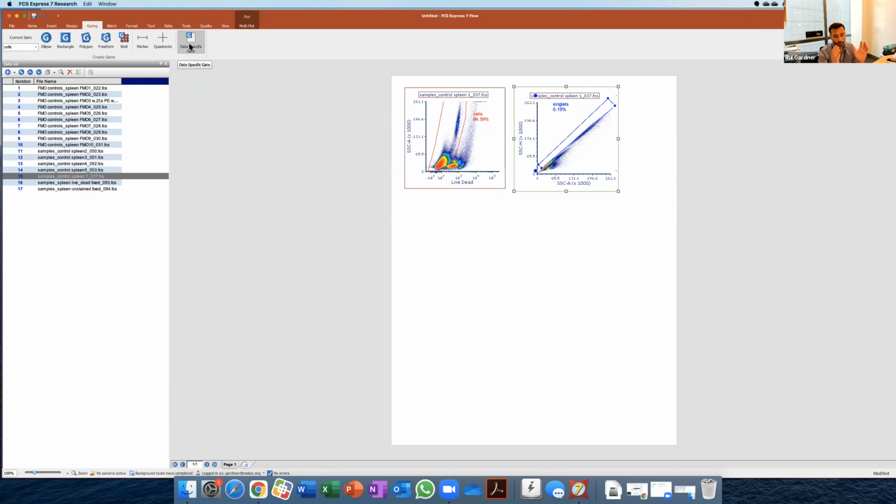And then when we start gating the actual populations, we're going to use our controls to be able to set the gates appropriately. If we have questions like, for instance, are these cells labeled with something, we can look at the unstained and compare the unstained, the FMOs and the data, and see if this population is really, for instance, an activated population of cells. Sounds good.